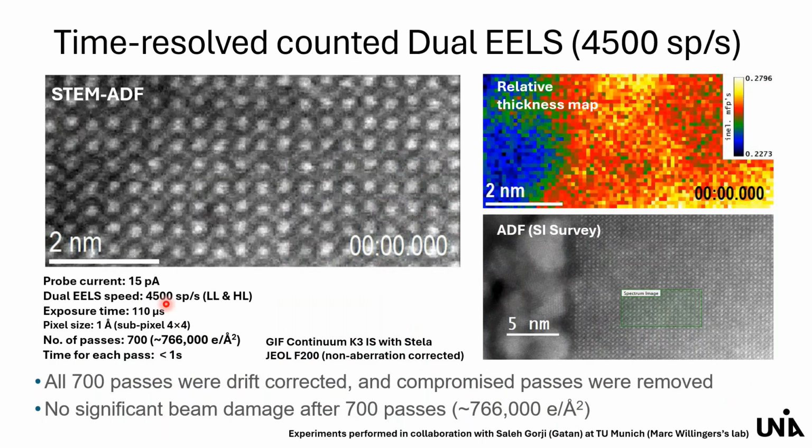Exactly. And the other question was, did you sum the first 100 passes of the counted EELS in GMS? Yes. We do have some videos showing how to do this. Because we have this time resolved data set, you can have access to all the passes, all the 700 passes. You can treat it similar to the way you treat actual in situ data, and you can sum, for example, the first 100 passes.